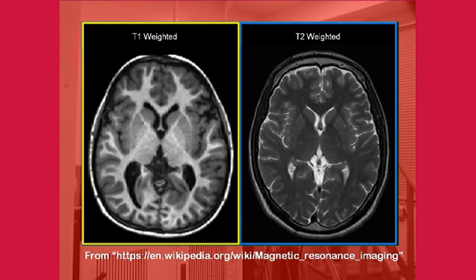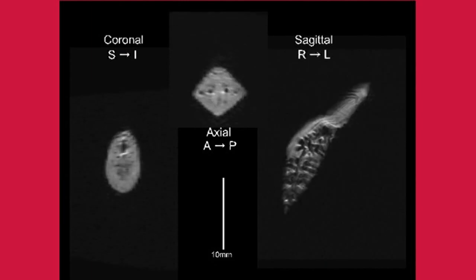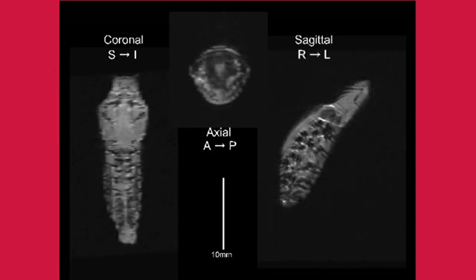The data obtained in this way was saved in the DICOM format, which is a standard format for recording 3D images for medical use. From this data, it is possible to make continuous sections from various directions, and even to reconstruct a 3D image. Common methods include the 3-dimension volume rendering method and the maximum intensity projection method.